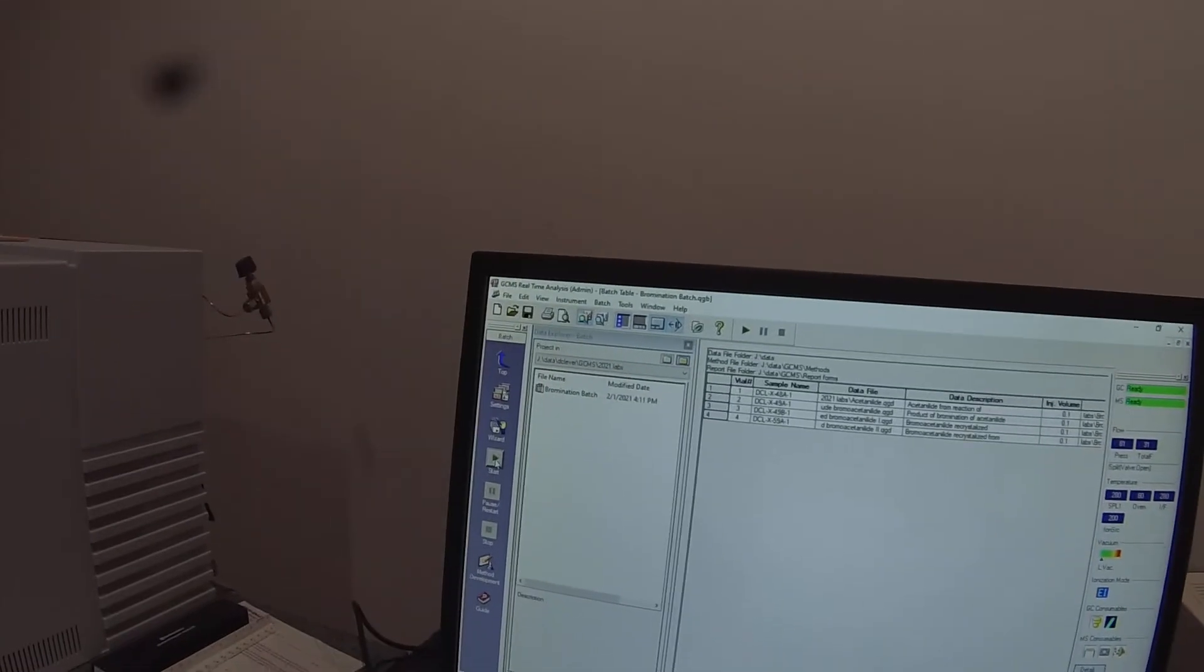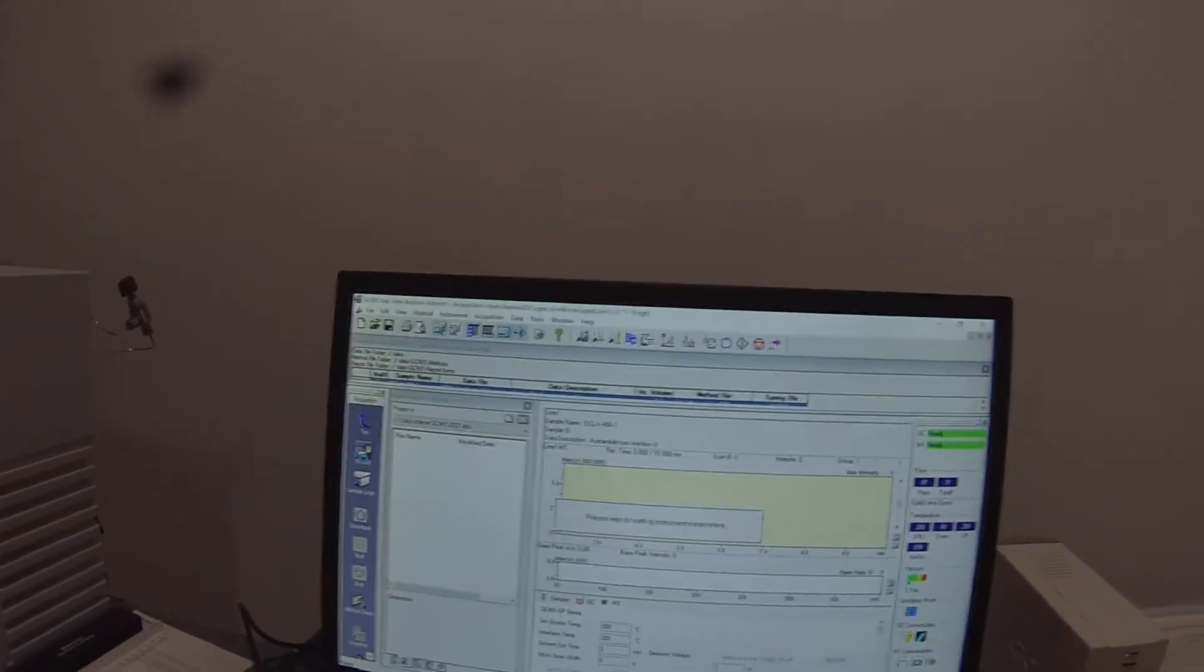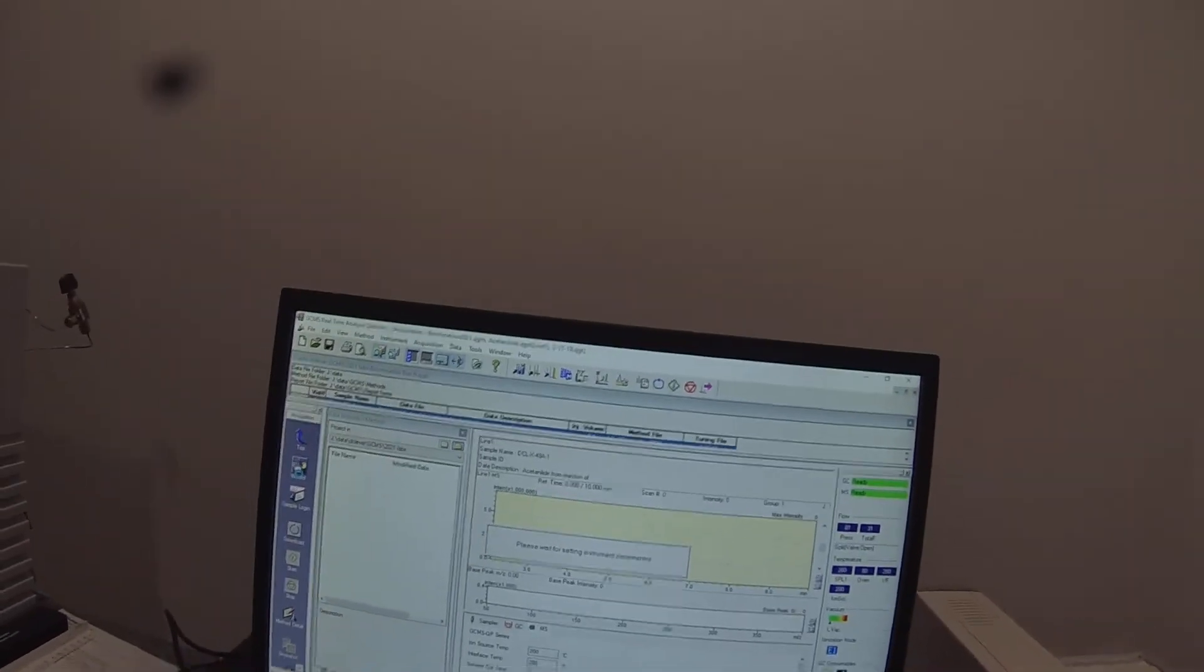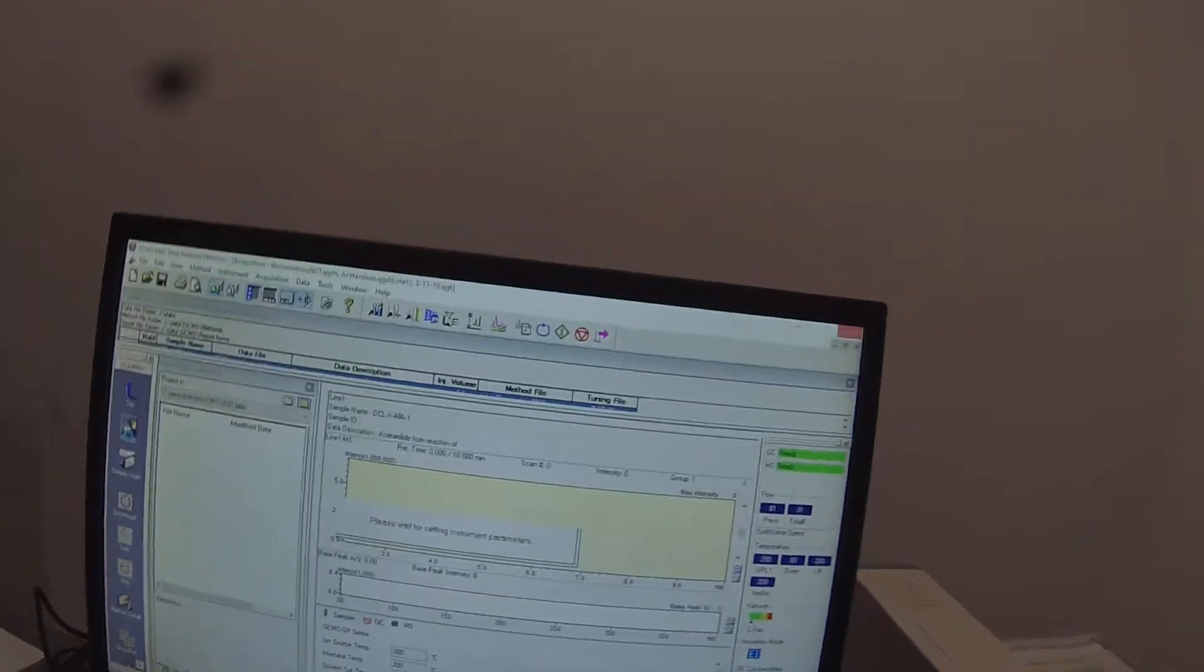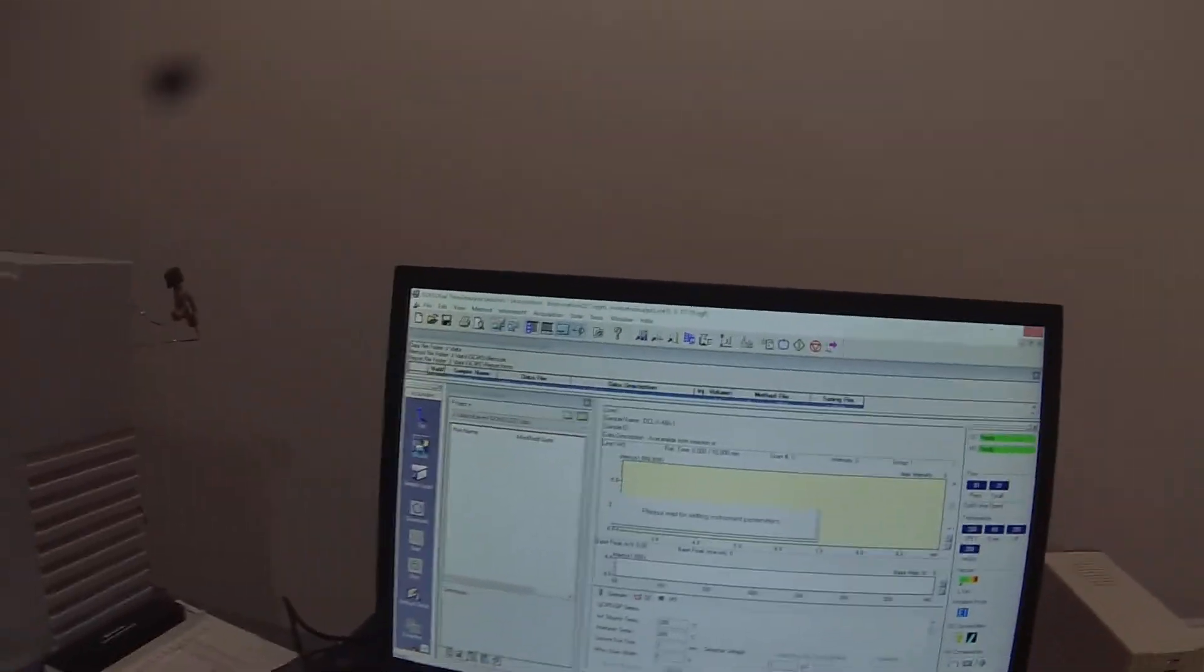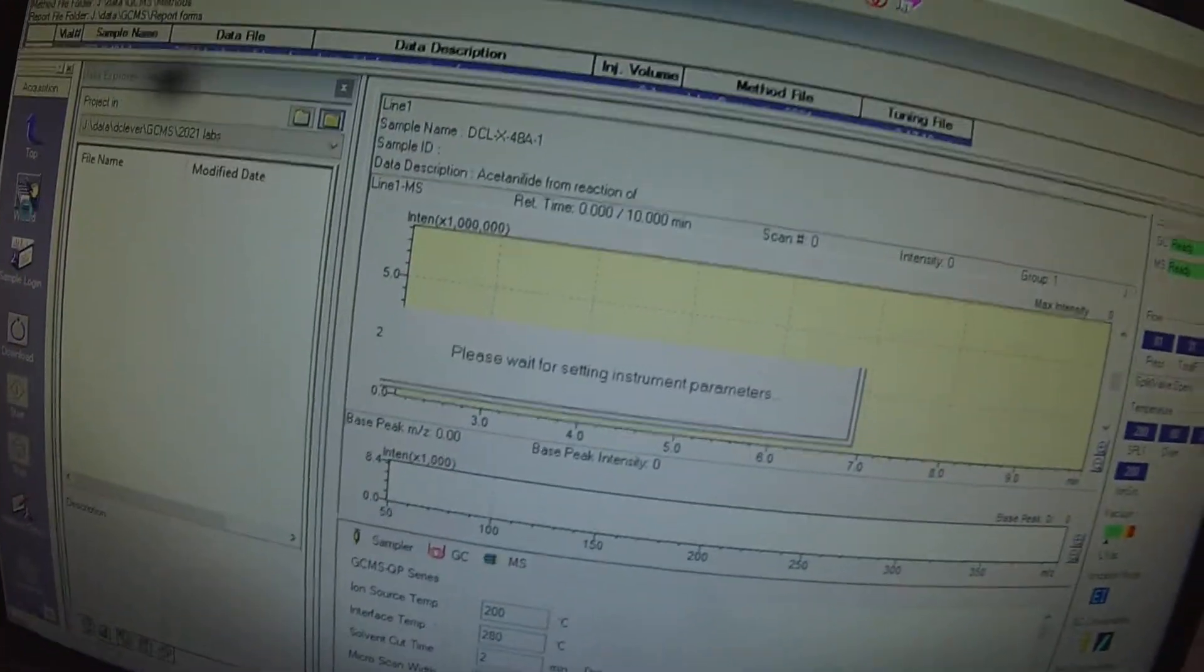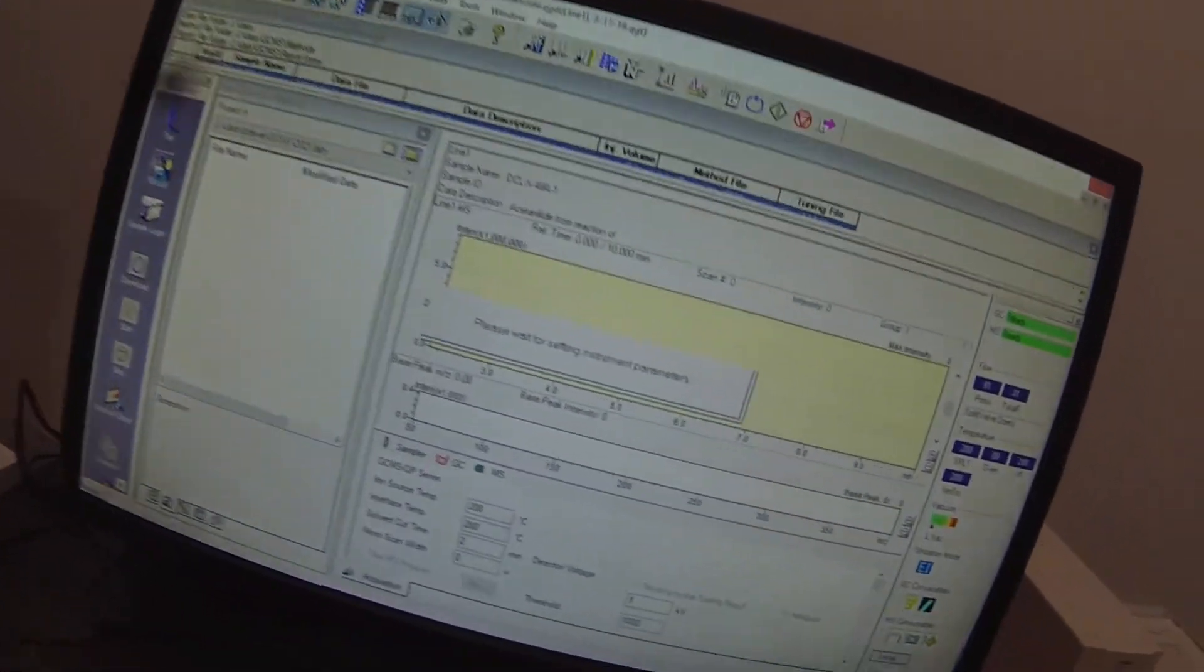And then we can click start. And I have this equilibrating so that the instrument was ready to go already at the correct flow rates and temperatures, and as soon as it starts the run we'll take a look at what those settings are.